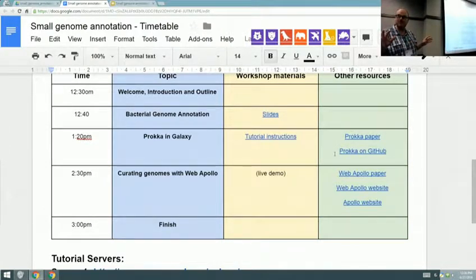You don't have to reassemble it. There's another data set you can use. If you're keen though, you can annotate whatever genome you want. If you happen to have a FASTA file from one of your projects at work, feel free to annotate that instead. I think it'll still work, but you can still probably go through with the actual tutorial.